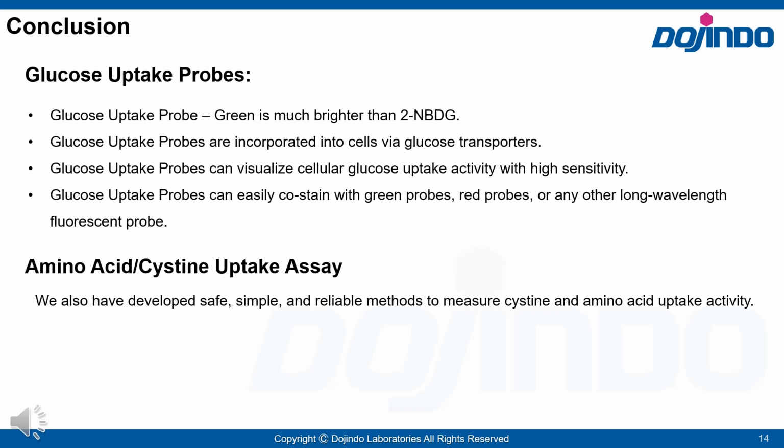Let me summarize the main points of today's presentation. We believe these novel technologies can be utilized in drug screening for biomedical studies as well as in diagnosis of various diseases, especially diabetes.